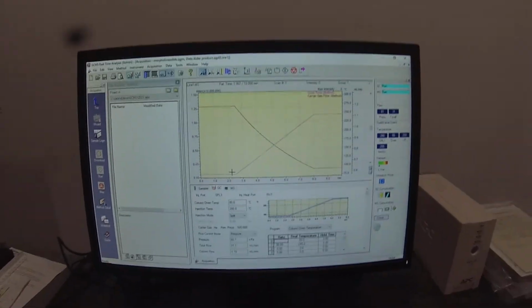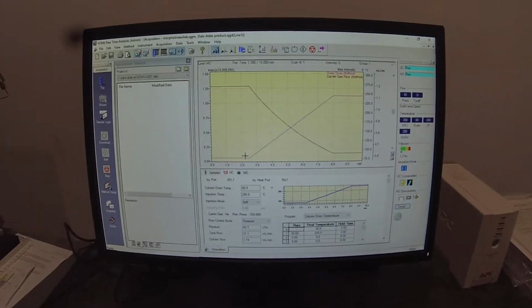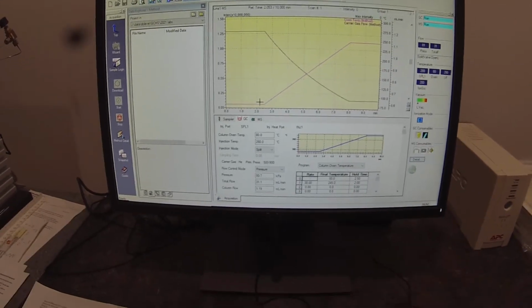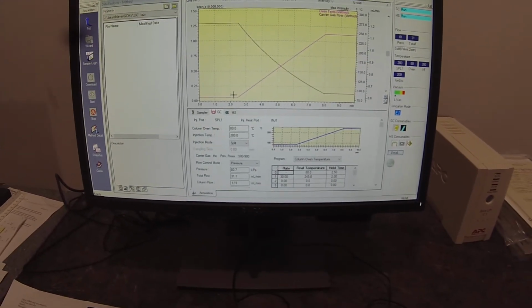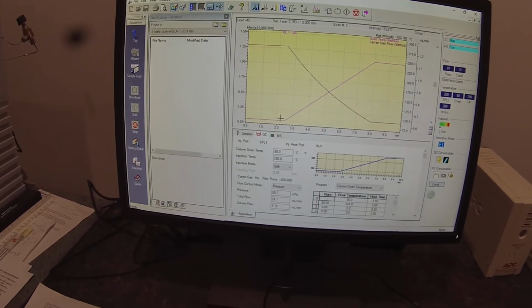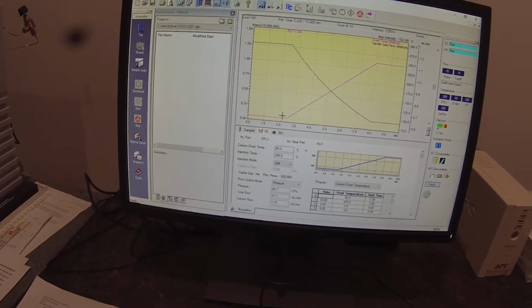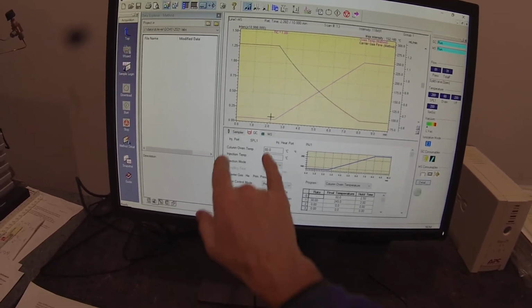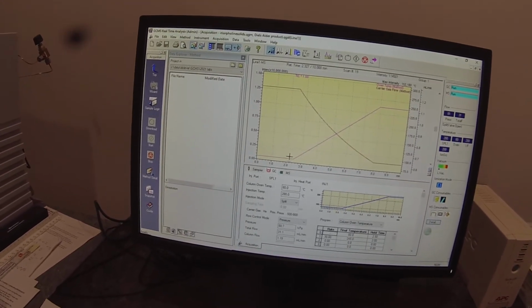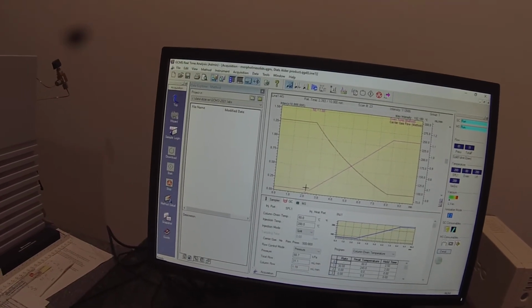Hopefully I got my camera angle right so you can see what's coming off on that screen pretty nicely. We'll see, I'll just tweak it a little bit. I think that's pointing at the screen. So it's been 2.1 minutes and the red line has started to come here as the data is collecting. And we hit that blank at 80 degrees. We held for 2.5 minutes, and for the first 2 of those we didn't collect data at all. Now we're just going to see what happens.